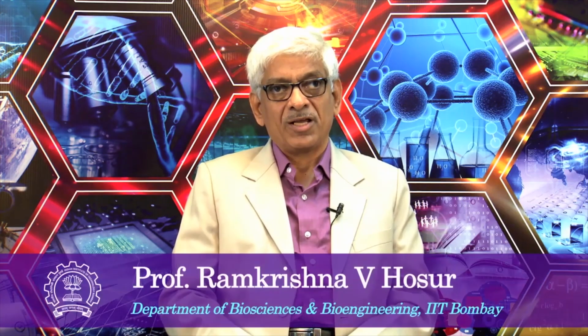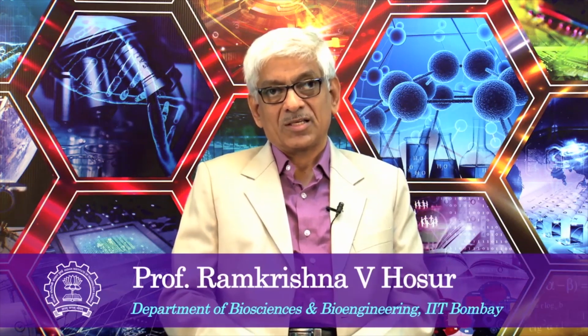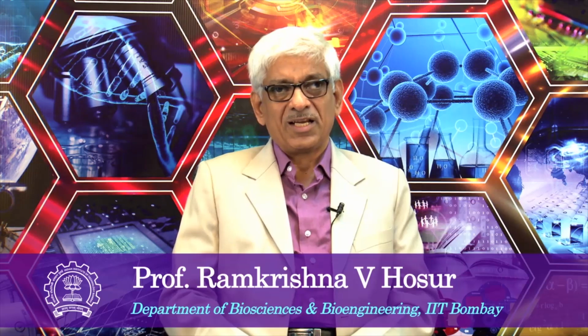So, today we are going to start a new topic, namely multidimensional NMR spectroscopy. This is basically an extension from the Fourier transform NMR which came up in 1966 and that caused a revolution in NMR applications. Things which could not be handled earlier could be handled because of the sensitivity enhancement it allowed.